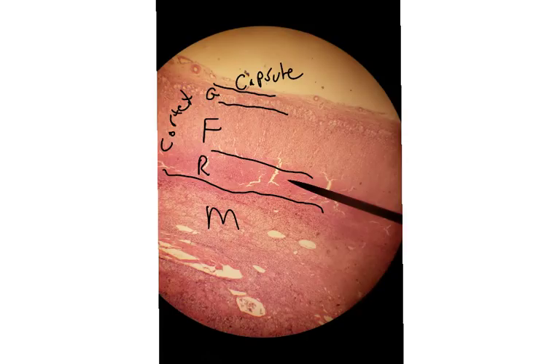Well, in addition to knowing the layers of the cortex, you'll need to know what is made at each layer. And if we can remember salt, sugar, sex, in that order, then we can kind of piece out what is made at each layer. Well, when we talk salt, all this semester we have talked about one of the hormones that moves sodium in the kidney. Do you remember what that was? That was aldosterone. Moving down to the next level, we've got the zona fasciculata, and we've got sugar. Well, one of the hormones involved in sugar metabolism is cortisol. Cortisol is made at the zona fasciculata.